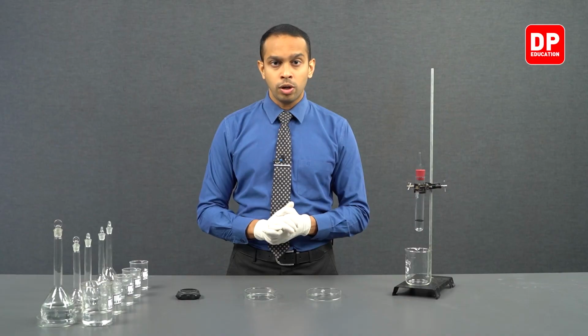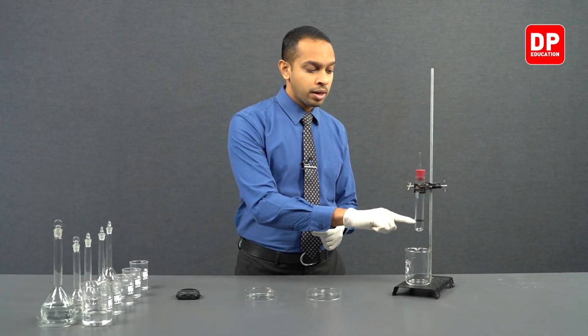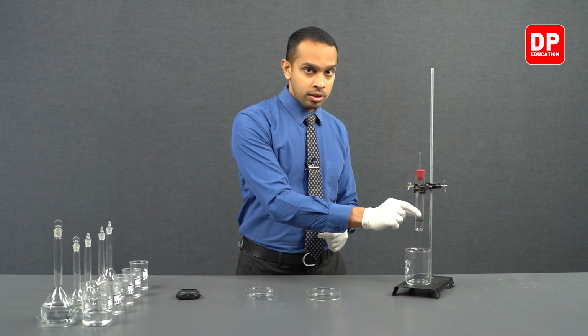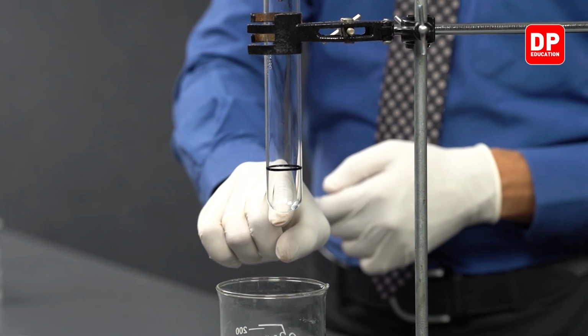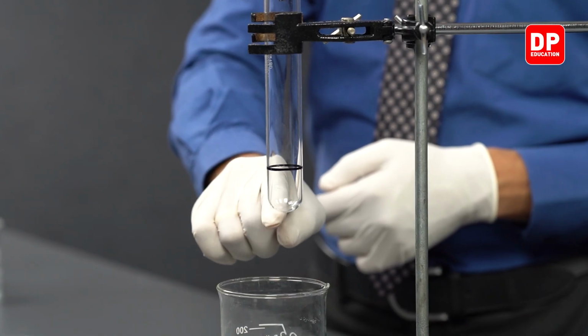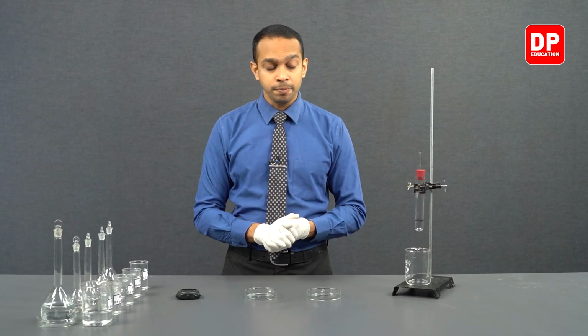To keep the volume of hydrogen gas collected constant, we have made a mark here in this particular boiling tube. You can see, from the bottom of the boiling tube, 3 centimeters high, we have drawn a mark.